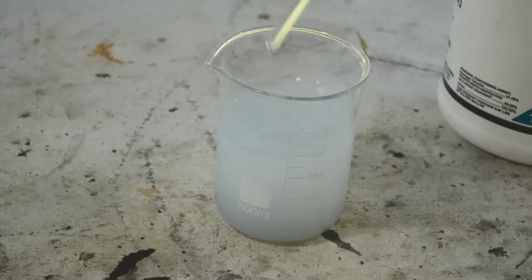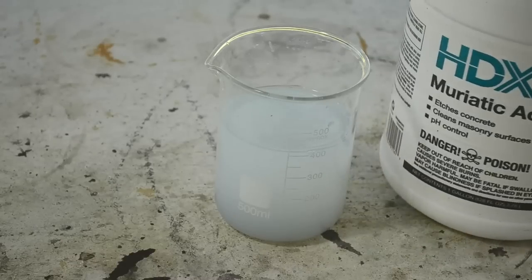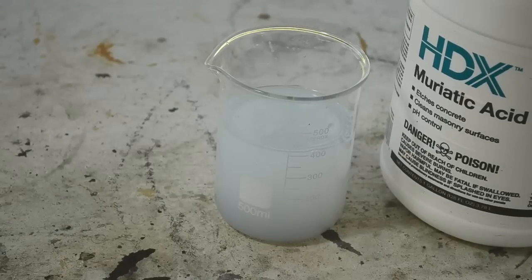Let me get a stir rod. But really, it's not as much as I thought. I mean, that is really not much silver dissolved in there. Okay, that is not a very opaque cloud of silver chloride. So we do have some silver that was dissolved by the sulfuric acid, turned into silver sulfate, dissolved in the water. Not enough to crash out of solution much when it was cold. But of course, once I put some muriatic acid on it, converted it into silver chloride, well, yeah, crashed right out of solution. In fact, we'll let that settle and see just how much silver chloride's in there. It doesn't look like there's much.